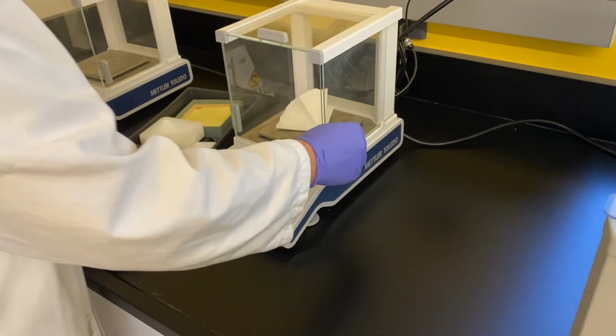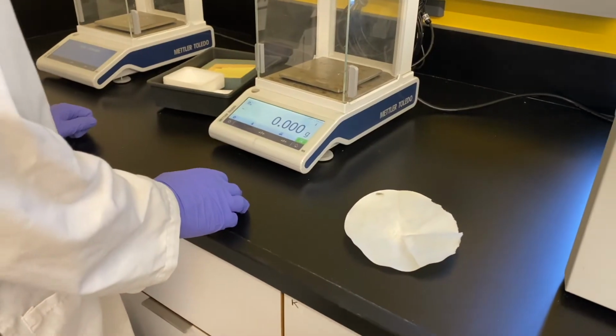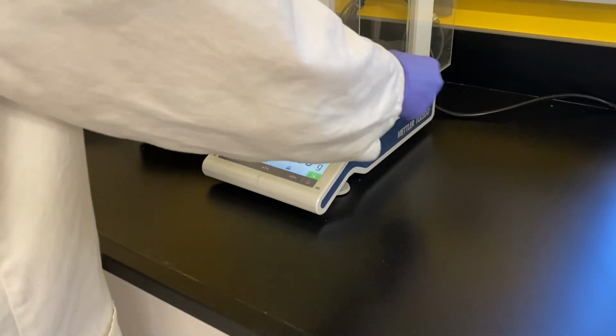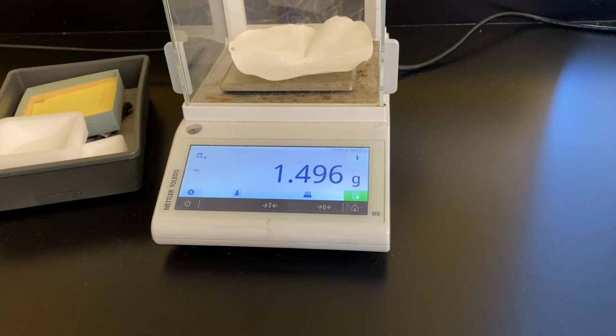So I folded it up a little bit just to make it easier to mass. Doing it a second time, remember, we put it back in the oven. We didn't show you this. We dried it again, and you can see we lost a little bit of mass, so it was still a little wet. So use that last value.